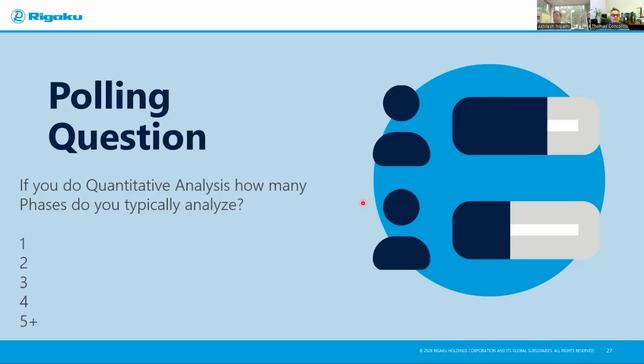Yes, you can. But remember, the peak intensities are compromised at lower and higher angles when you go from fixed to variable. So as long as you are able to take care of this, either through preferred orientation correction or some other type of correction, then you should be good. I would suggest, very quickly, run a sample where you mix two known phases.